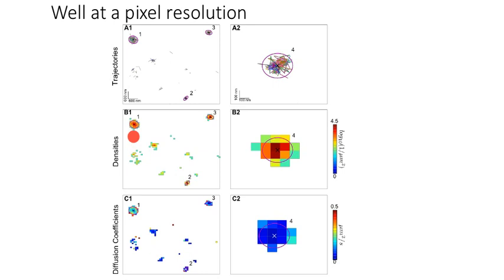You can look at the density: you fix a grid, and on the grid you look at the number of points that you obtain, and you color each bin according to the density. This is done here. This is an example where you see discretization in this very coarse grid. And you can get information, for example, such as the diffusion coefficient estimated at the grid.